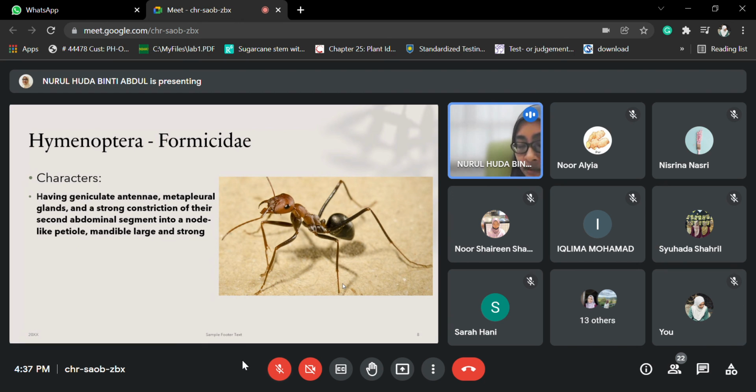the characteristic. But sometimes there is a part of claw that can be used for identification, where sometimes they just ada satu claw. Sometimes they have a fork atau bercabang like 2 claw. Maksudnya kadang kamu nampak dia just macam satu penyangkut je. Dia macam a single claw. So tu juga boleh membezakan lah.